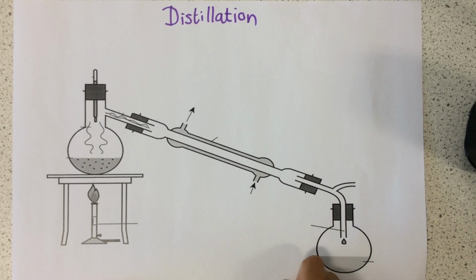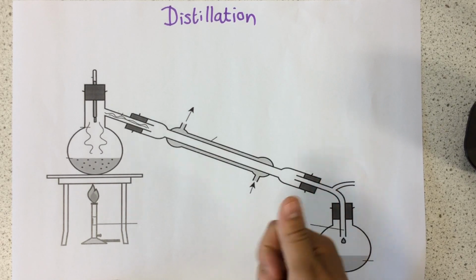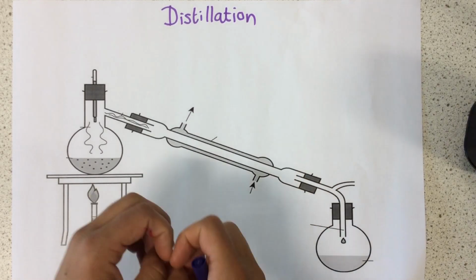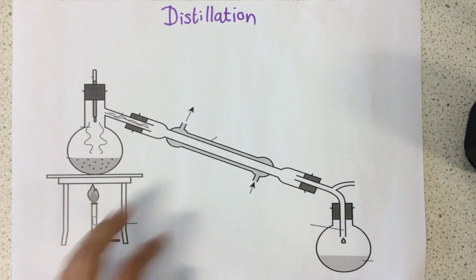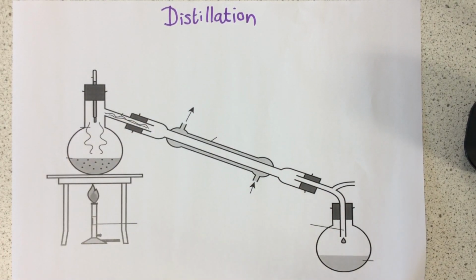Okay, today I'm going to talk to you about distillation. We're going to look at simple distillation, we're going to look at fractional distillation, the equipment required and how it works, and the difference between simple distillation and fractional distillation. Okay, so let's get started.